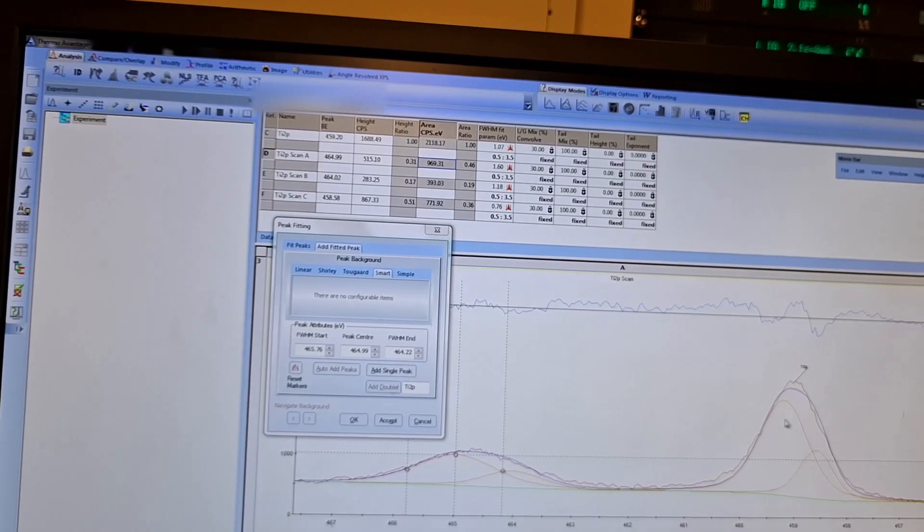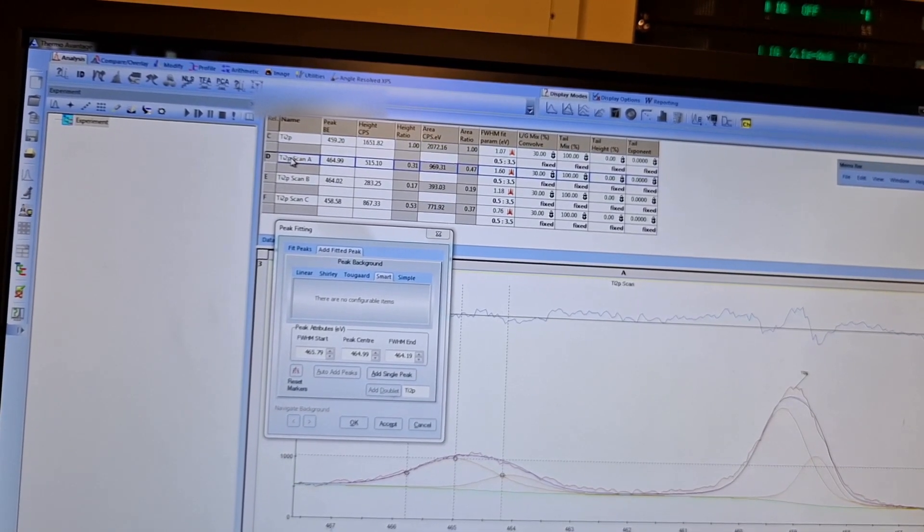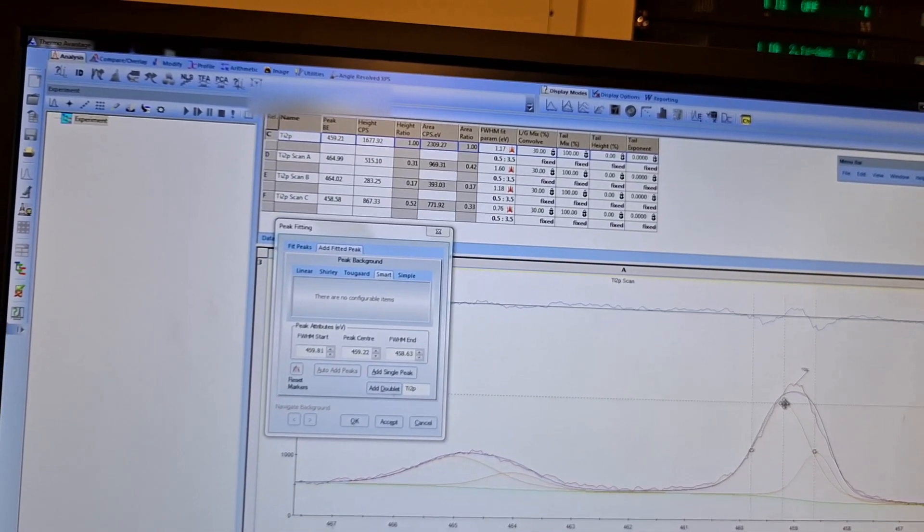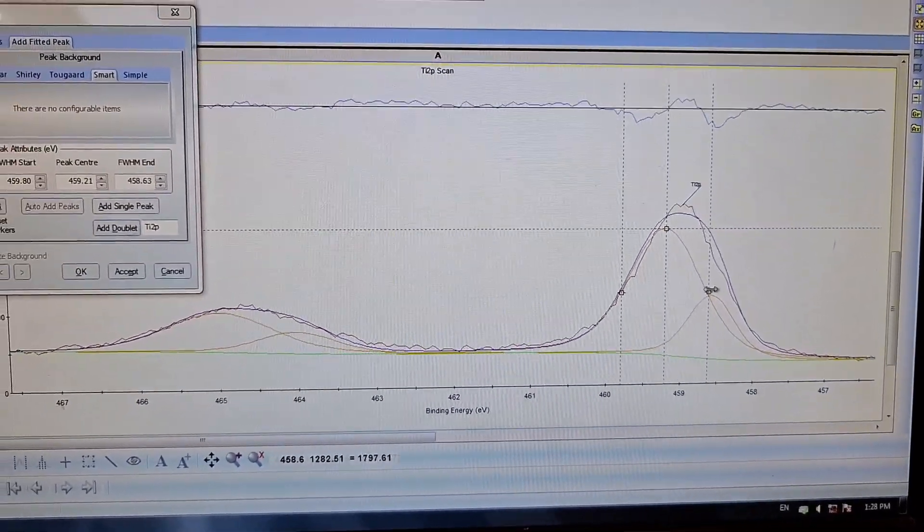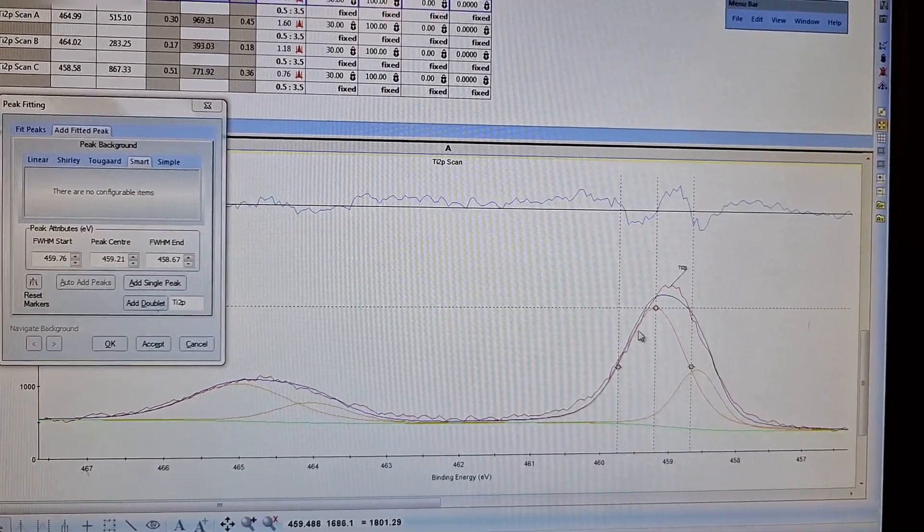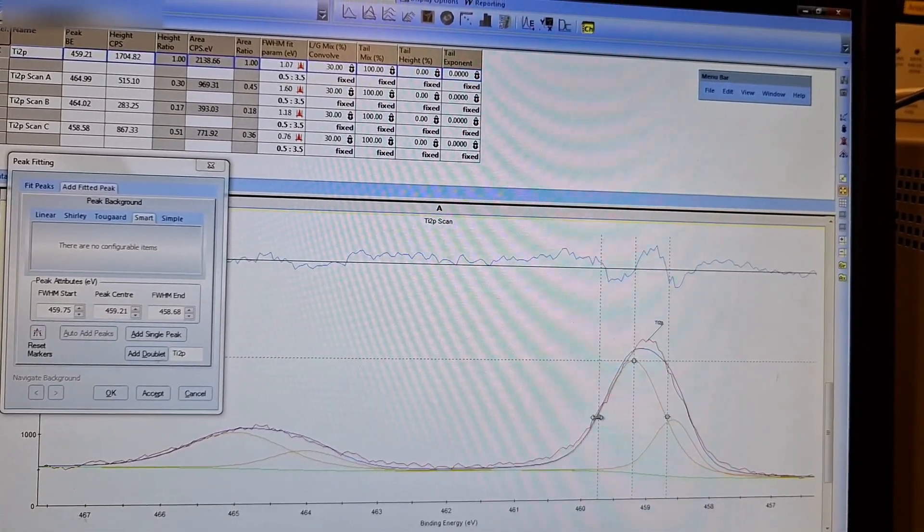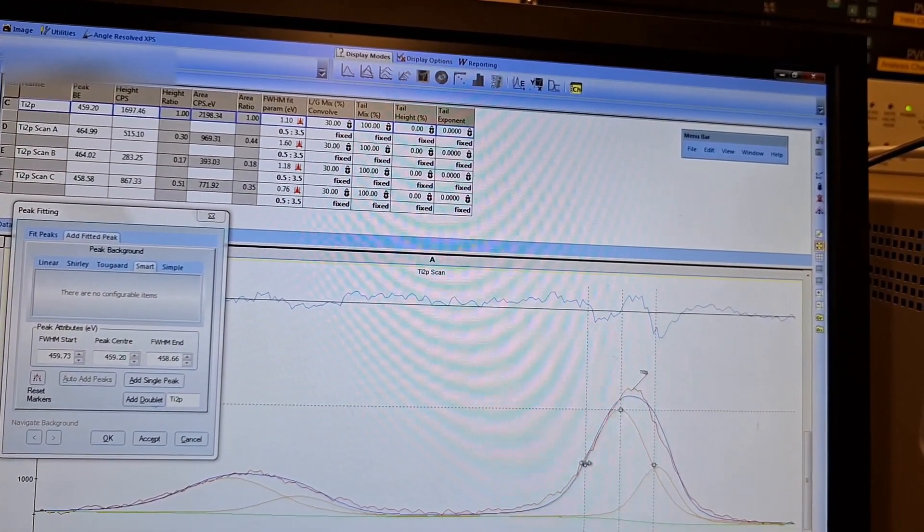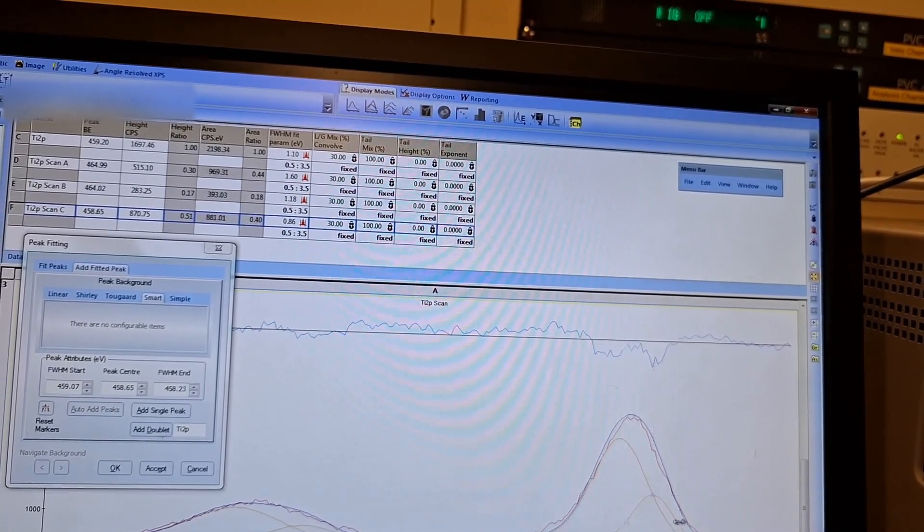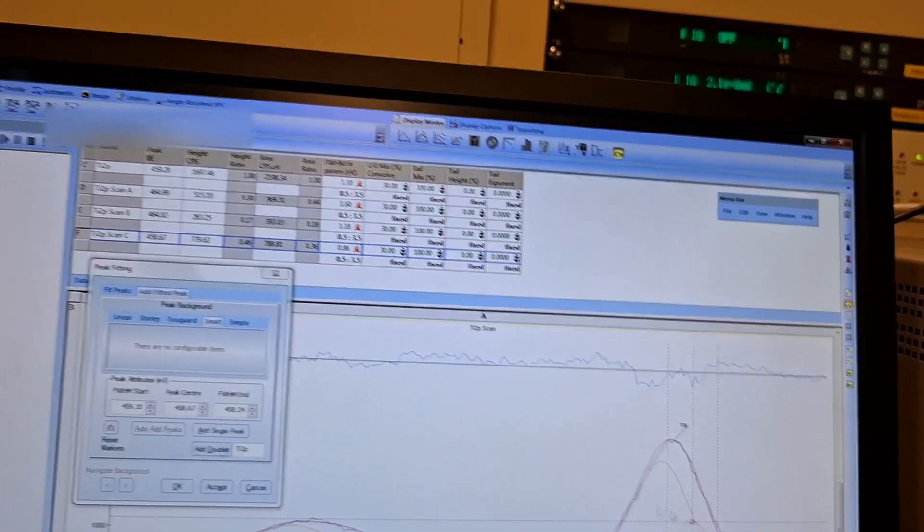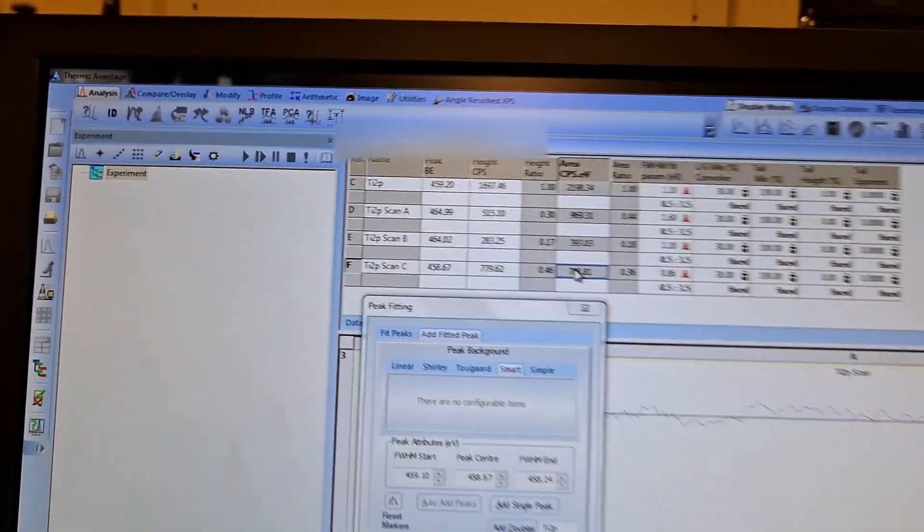I assume you know all of this important information. The problem is that this envelope doesn't match with the signal, so I have to decrease the full width at half maximum a little bit. Unfortunately, I cannot change the Gaussian and Lorentzian functions. Maybe I should change here to make it better. Maybe I should change the half maximum of the other one. I can decrease it. I should check the area again. It is still good enough.